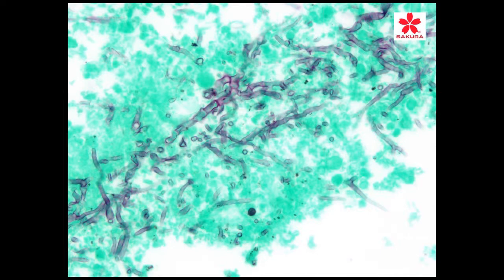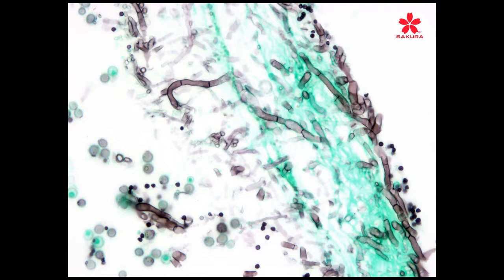So optimal staining is that you have to have the effect of the silver impregnation only to a certain point, so that it doesn't prevent you from being able to see the translucency. You should be able to see a light gray appearance, not black, and then just a light laying down of the counterstain. Now another example here that we see there.